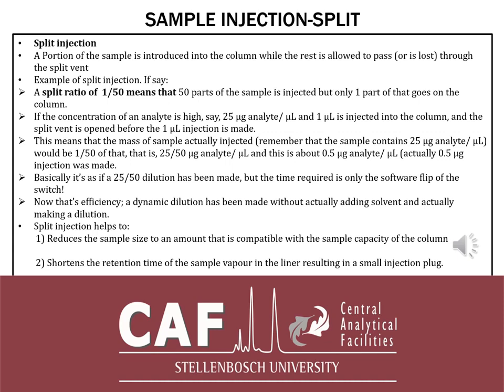So that's how I always explain to people, especially students, the importance of understanding the split and splitless injection. That question that I asked earlier, if it's one peak, can give a lot of answers. It helps to understand if you know the difference between a split and a splitless injection.